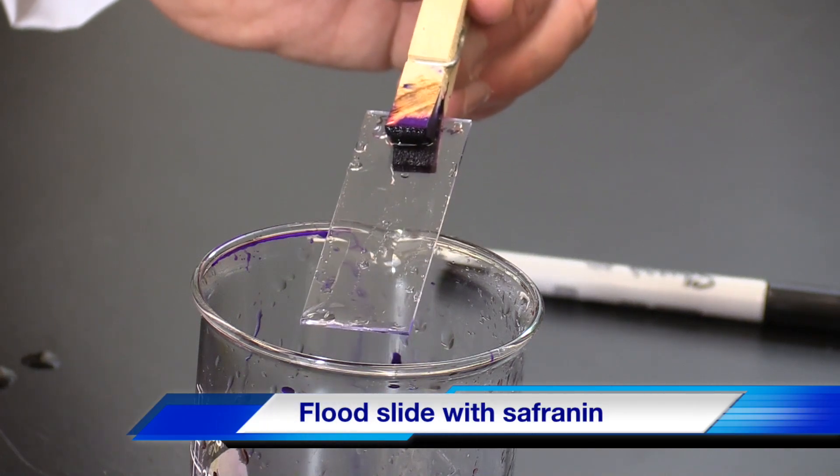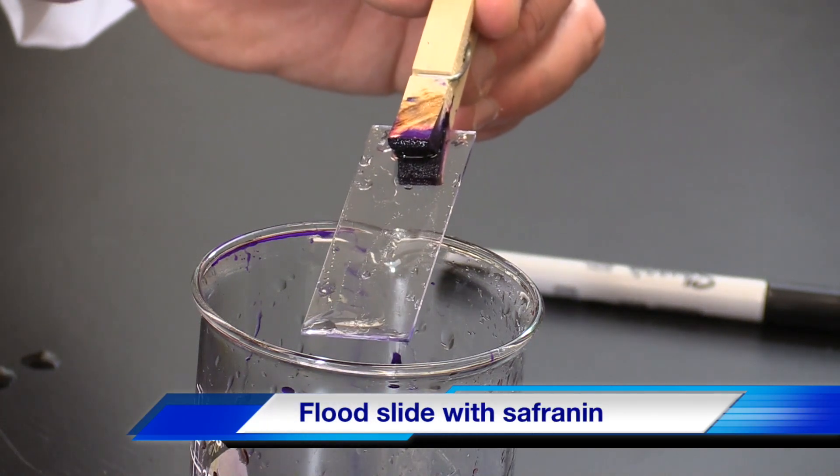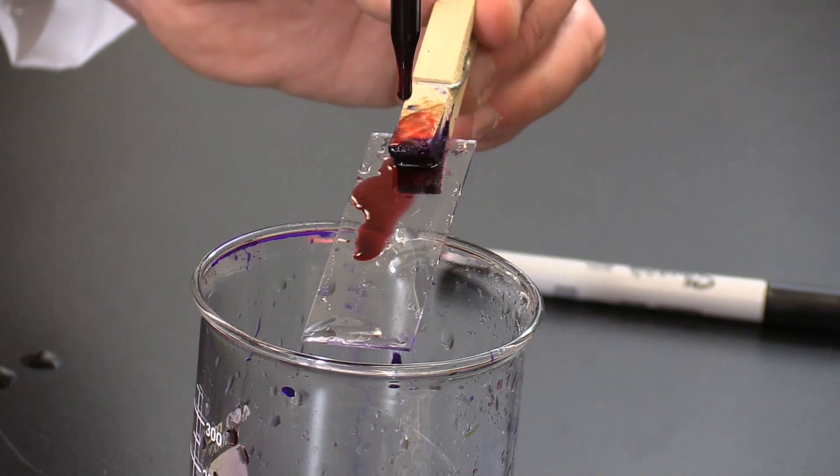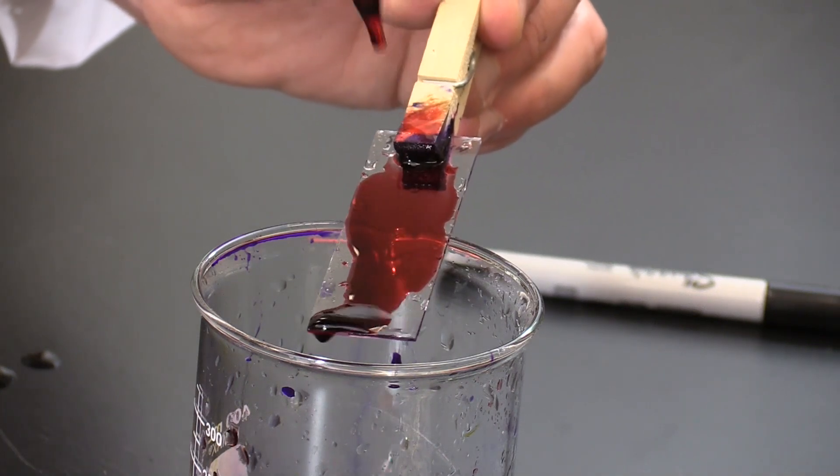Flood the slide with safranin to cover the bacterial smear and allow to stain for one minute. The safranin will stain the decolorized Gram-negative bacteria pink.